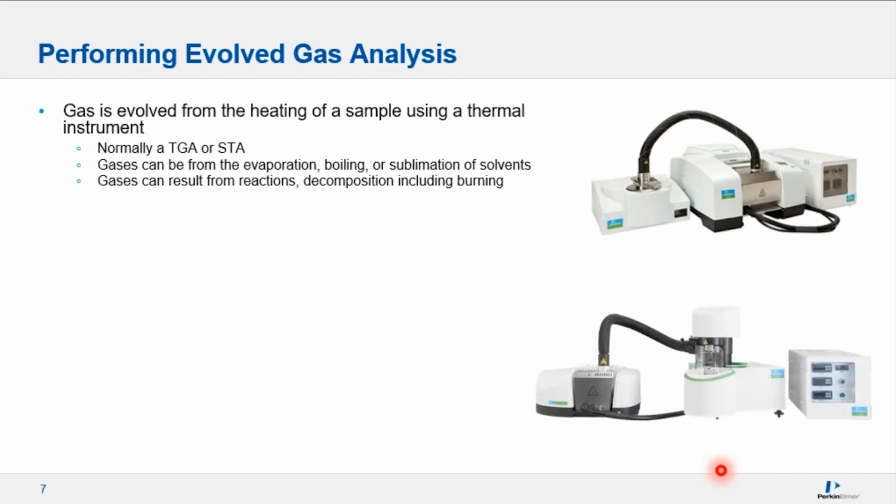So all of these thermal instruments have the capability to change environmental gas or purge gas, making combustion and oxidation studies possible.